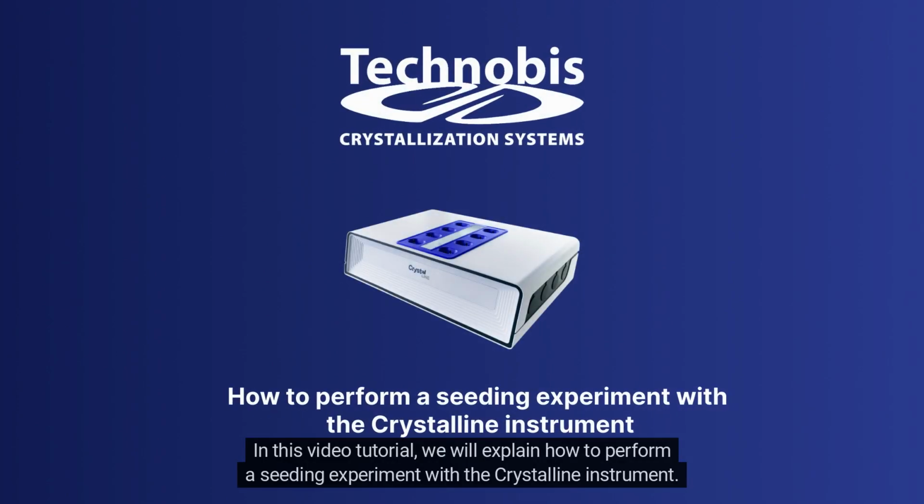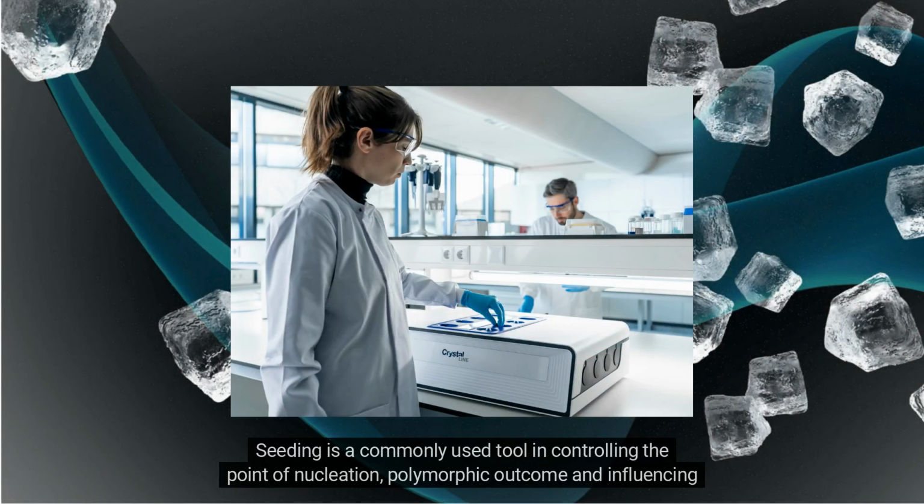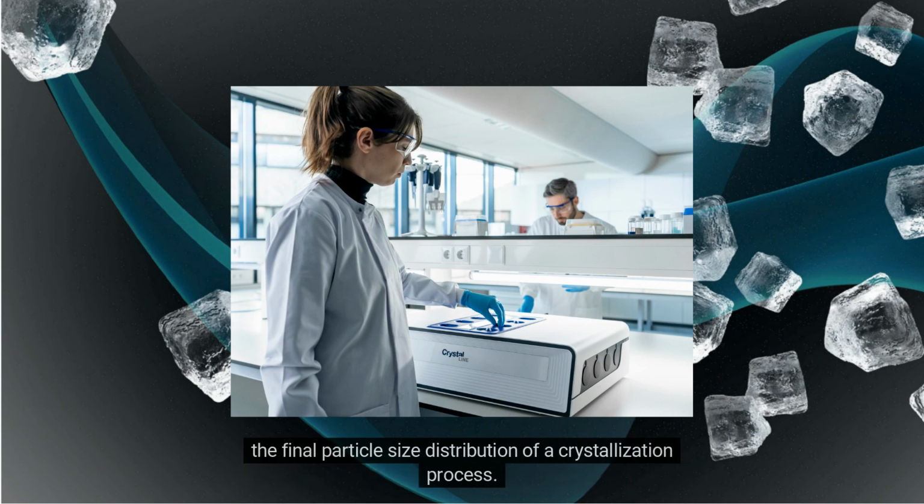In this video tutorial, we will explain how to perform a seeding experiment with the Crystalline instrument. Seeding is a commonly used tool in controlling the point of nucleation, polymorphic outcome, and influencing the final particle size distribution of a crystallization process.